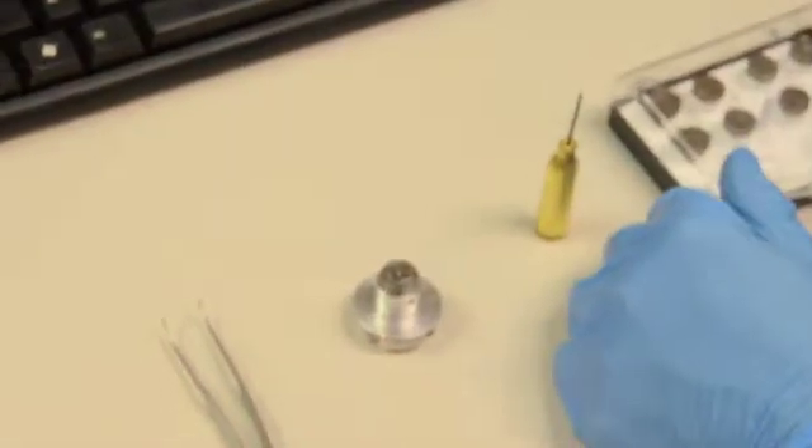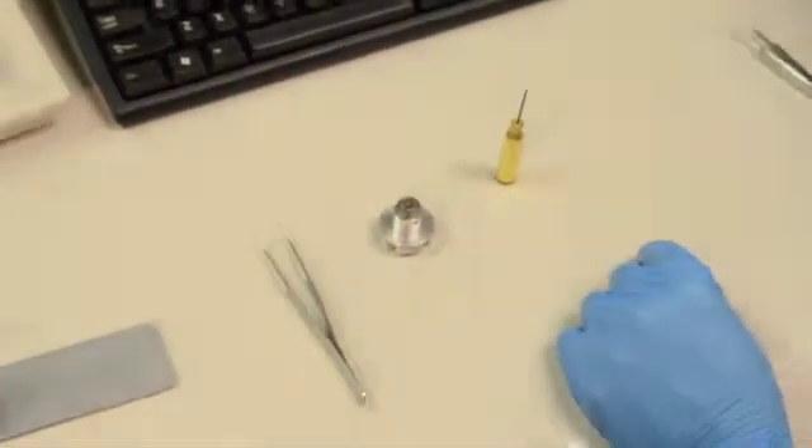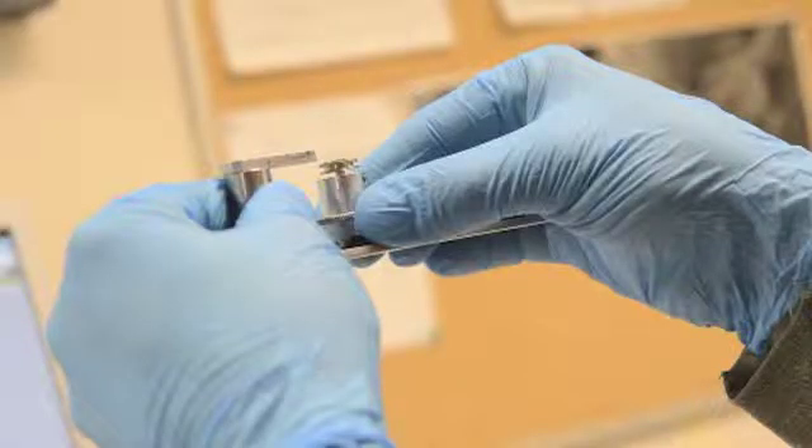Close the lid on your other samples to keep them clean of any airborne dust particles and place them somewhere safe. Now check the sample height. The top of your sample must not extend above the top of the sample height tool, or you may damage your sample and the SEM.